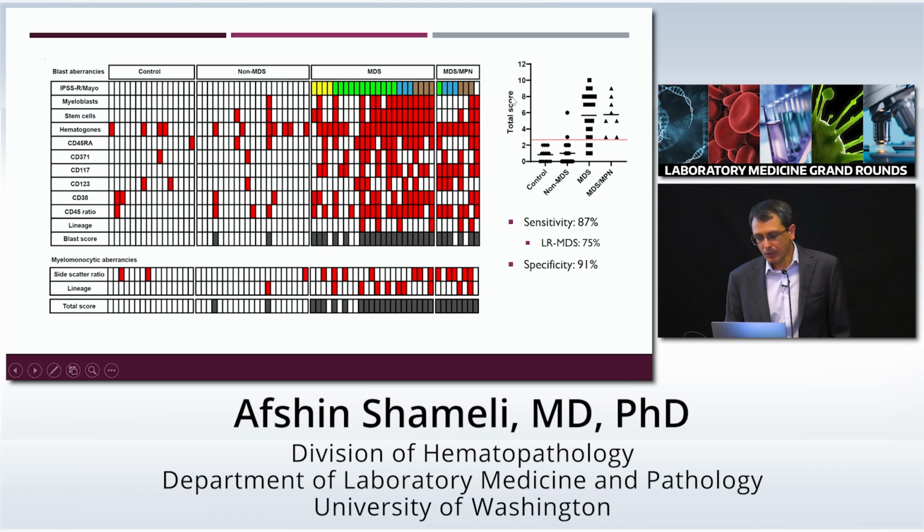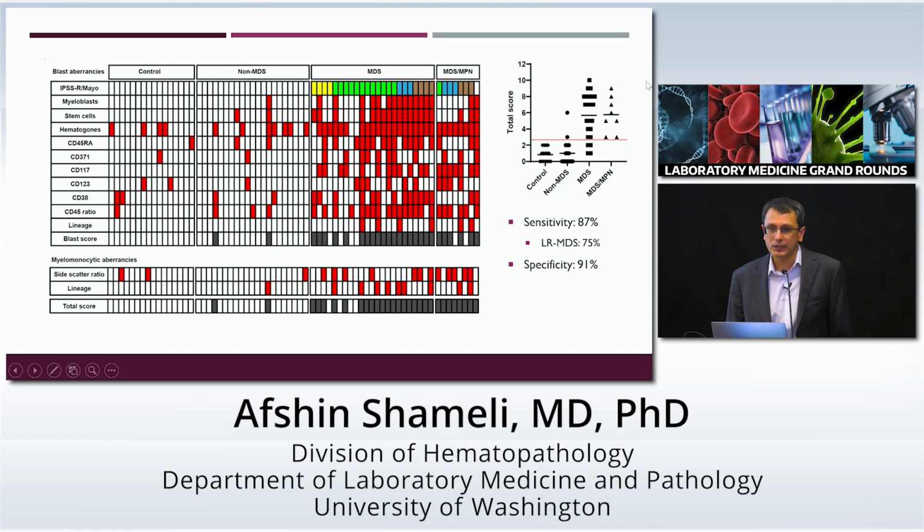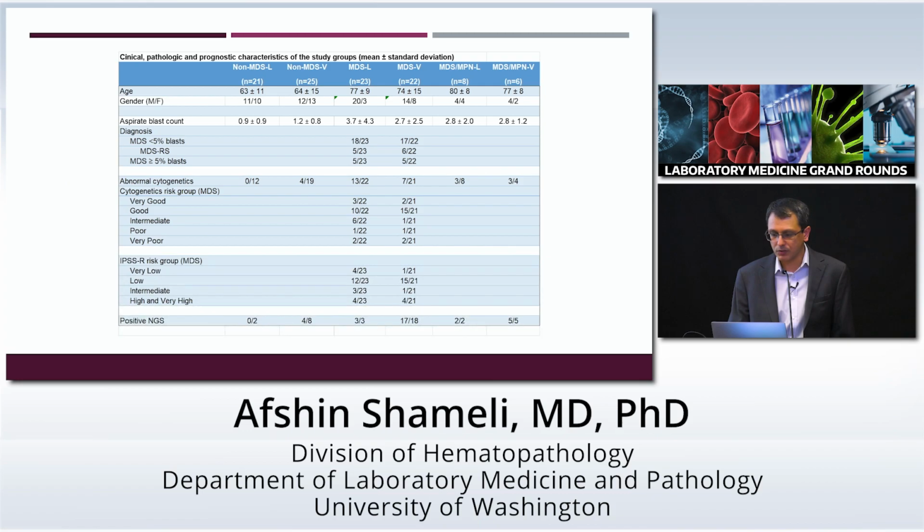So overall, what it showed is that we could generate a scoring system that was totally quantitative and did not require the evaluation of complex maturation patterns, and is very helpful in diagnosis of MDS, especially because this can be totally automated and remove the need for interpretation by pathologists.